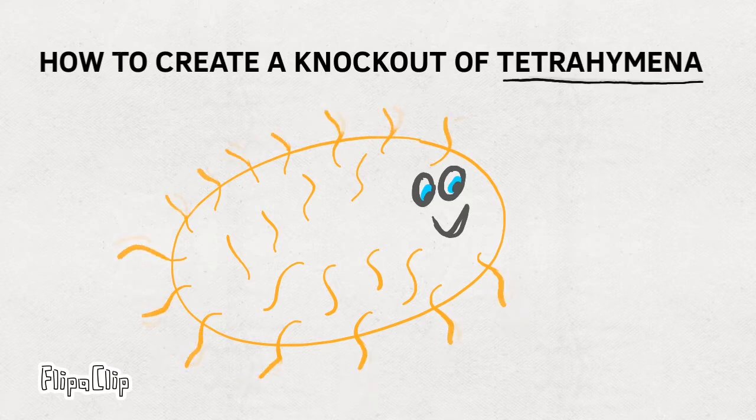I'm Kennedy. I'm Ari. I'm Reagan. And I'm Cameron. The goal of our experiment is to create a knockout that will impact the cilia motility in Tetrahymena.